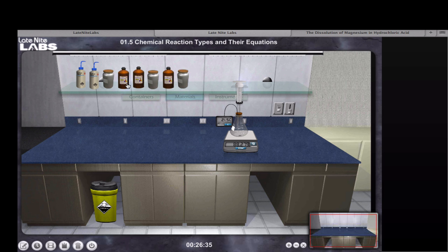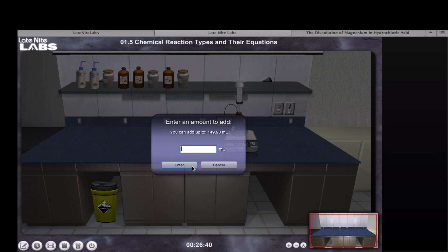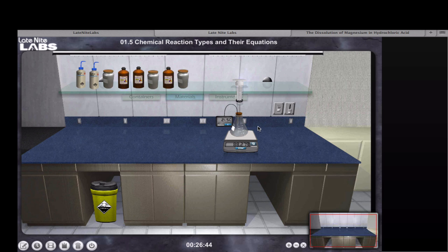Finally, to get the reaction started, I need to add 6 molar hydrochloric acid. I'm going to add about 10 milliliters of that to the flask, and then we'll zoom in and watch what's happening.